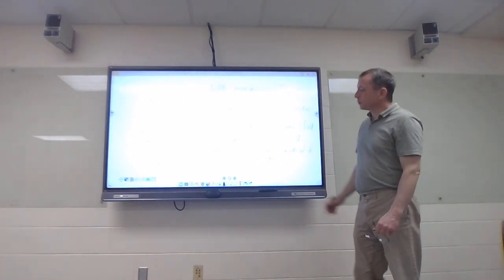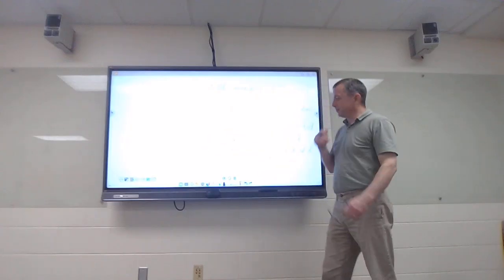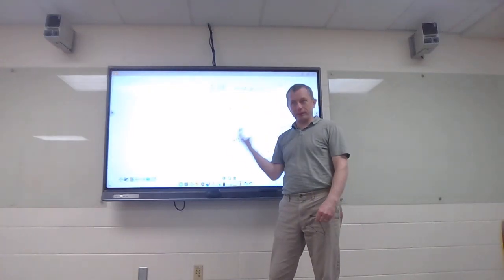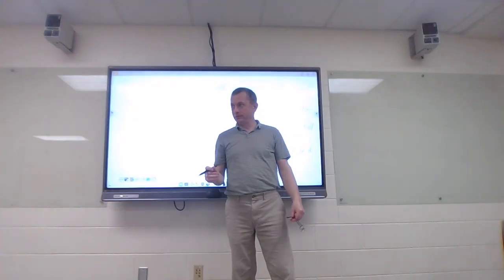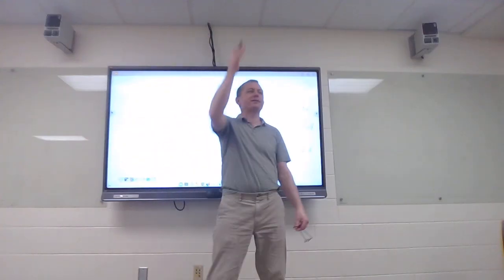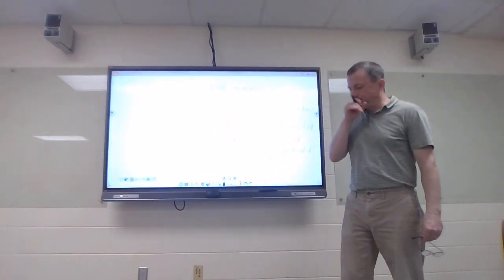All right. So we're getting, and I'm not even telling you what radio wave we're getting. I don't know what station it is. I don't know what the hertz are off the top of my head. That depends on which nuclei and what's around that nuclei as to the exact signal. But I can measure the signal. I can scan through all of my stations. If I scan through all my stations and I get a signal, I create a peak. And we can see those peaks, and that's what we're going to observe in an NMR.